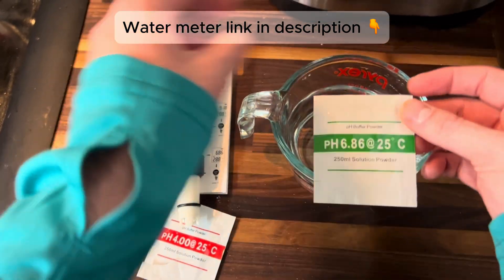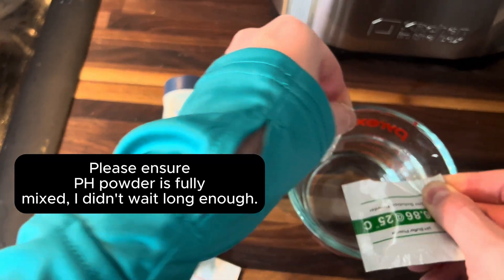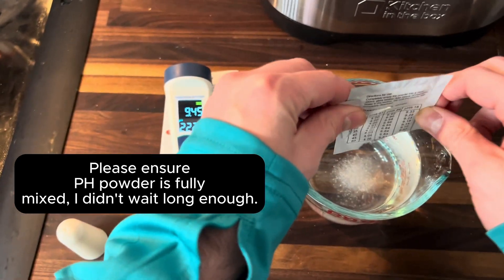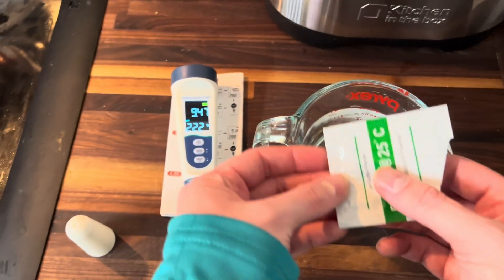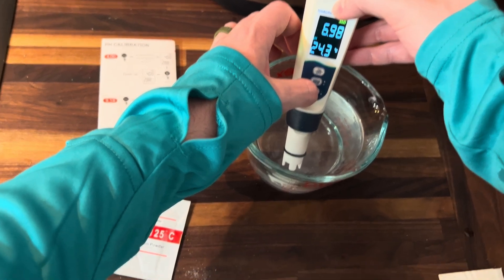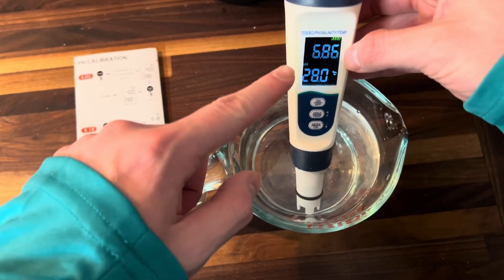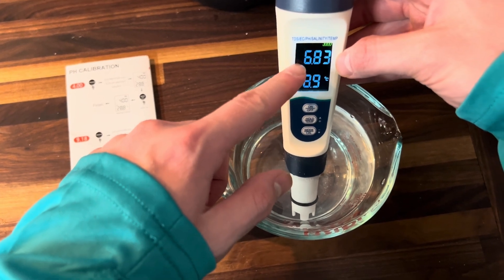I'll go ahead and pour this in. This is the home stretch — the last one. We're going to let this dissolve into the water, and when it's ready we're going to calibrate for the 6.86. We're going to hold down mode for three seconds and it's going to flash and say 6.86. That is our calibration right now, which is exactly what we want. Once it's done flashing, you know that it's complete.